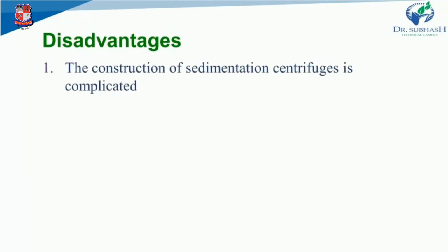Now, obviously, there must be disadvantages. So, the first is that the construction of a sedimentation centrifuge is complicated. Second, its capacity is limited. These are the most important disadvantages which any person who selects a centrifuge has to keep in mind, that the capacity is limited.